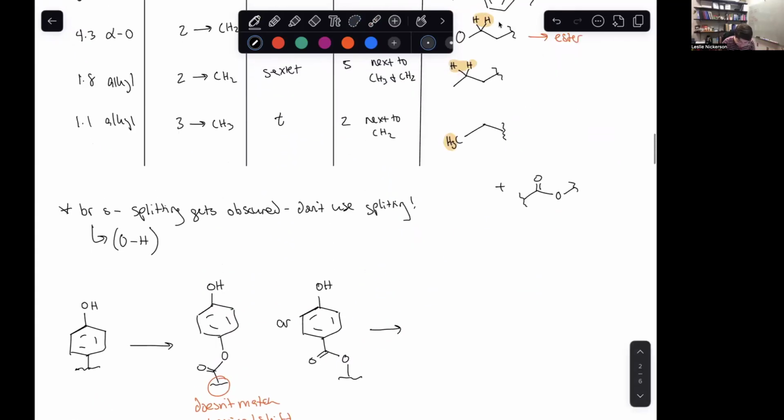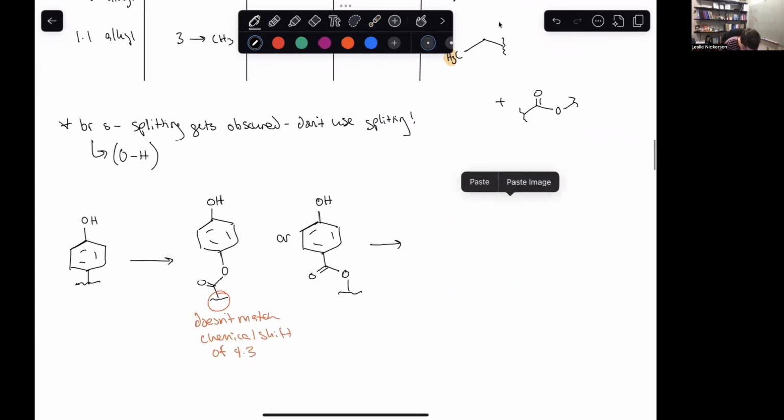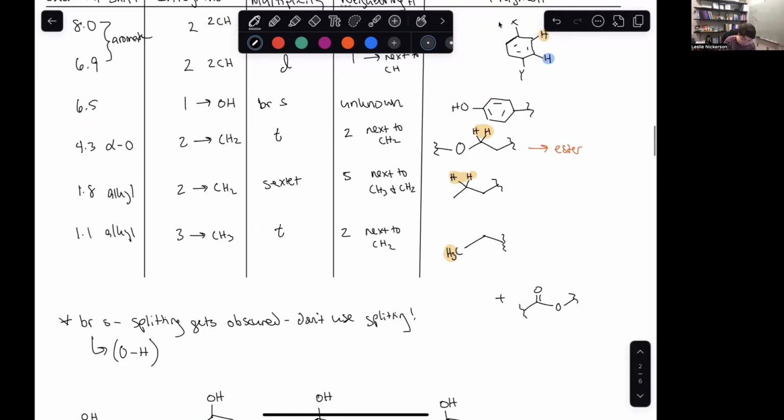Now, following on with this oxygen, I'm putting on this next piece. So I've got a CH2 and a CH2. Then I have another connection point that I need to deal with, but I've got those two carbons in there.